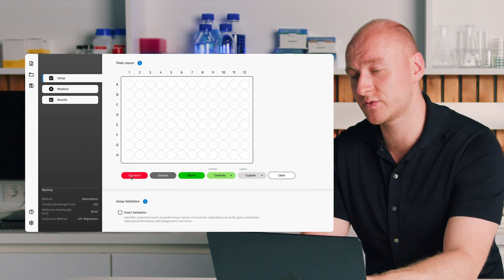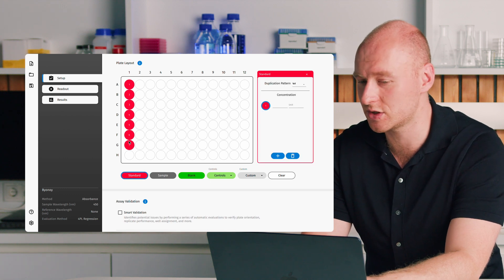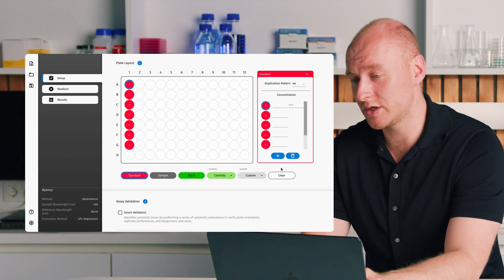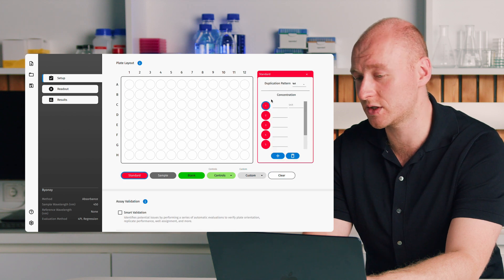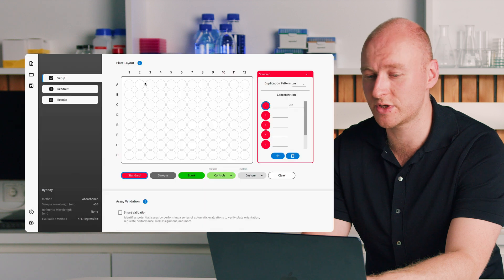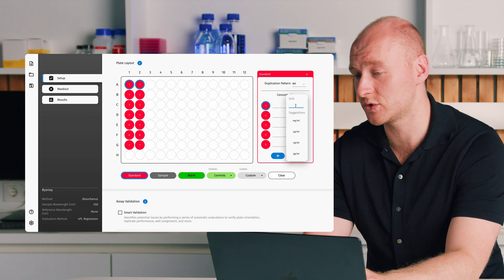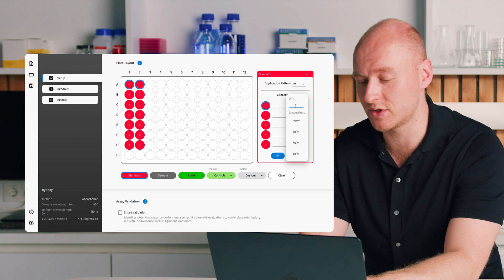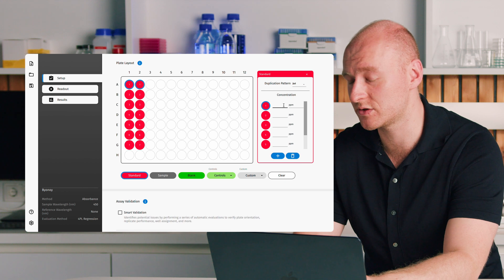If we want to define some standards, we click on standards and click and drag down the plate. If we want to define them in duplicate, we click on duplication pattern, select a two-by-one duplication pattern, and just click and drag — they will all be defined in duplicate. You can then select units from the drop-down menu or type them in, for example PPM, press enter and they're all filled out.